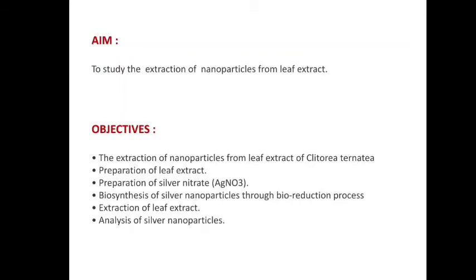Objectives: the extraction of nanoparticles from leaf extract of Clitoria ternatea, preparation of leaf extract, preparation of silver nitrate AgNO3, biosynthesis of silver nanoparticles through bioreduction process, extraction of leaf extract, analysis of silver nanoparticles.